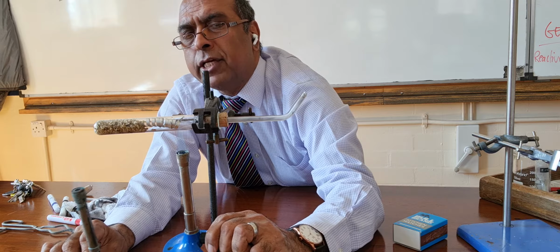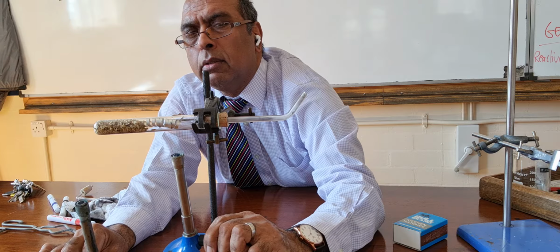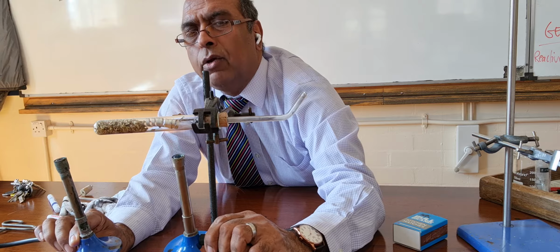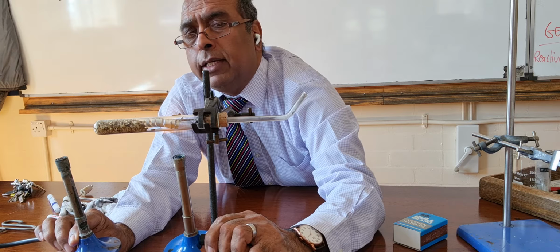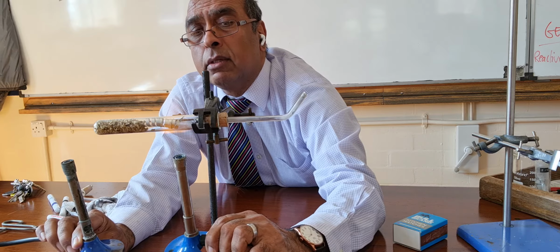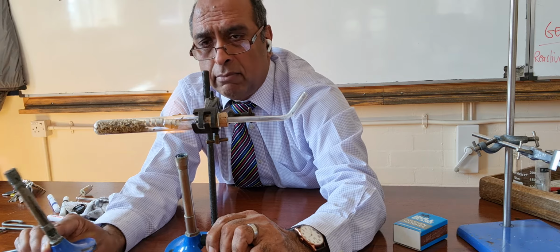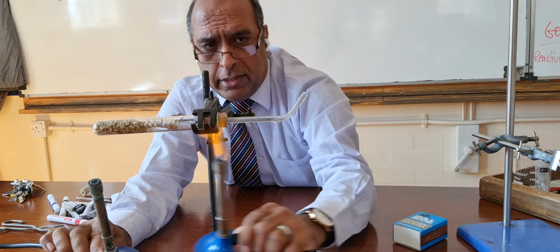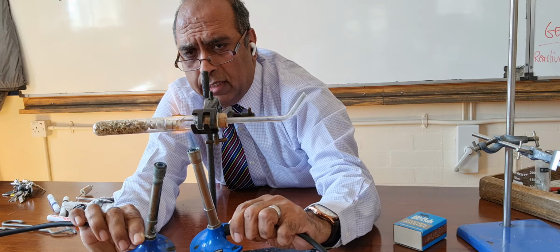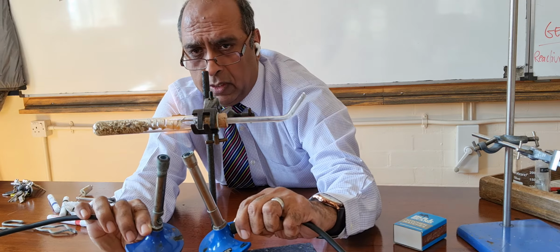Now I'm going to get this part of the test tube really hot. And when it's really, really hot, I'll know it's hot because the tube underneath will glow orangey red. That's the glass. And then I'm going to use this burner to make steam. Steam will then react. Can you see steam coming out the end? Oh, it's getting a bit damp. I don't like it damp. Let's get it really hot. Come on.